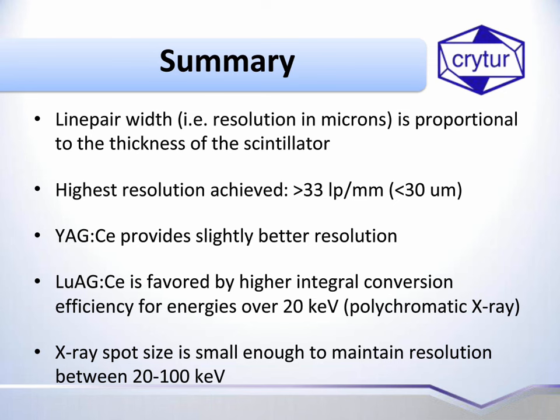As I said, the X-ray spot was about 1 micron, and that's it. The resolution of the system is more than 1 micron, so it means that the X-ray spot didn't play any role in that.